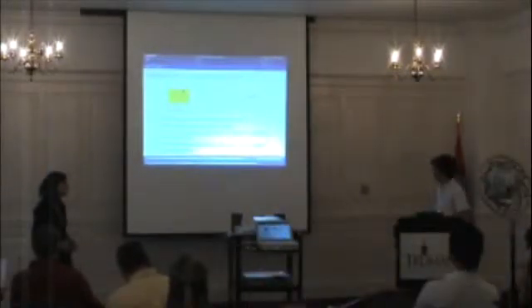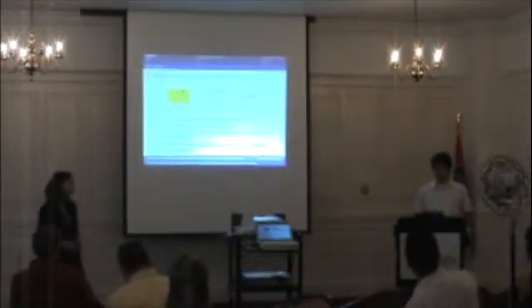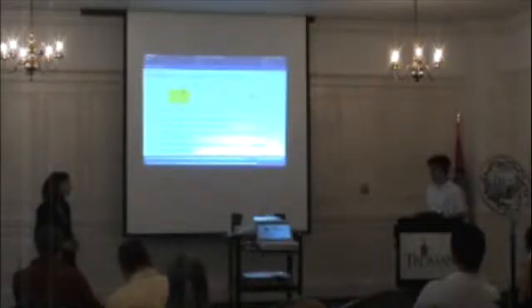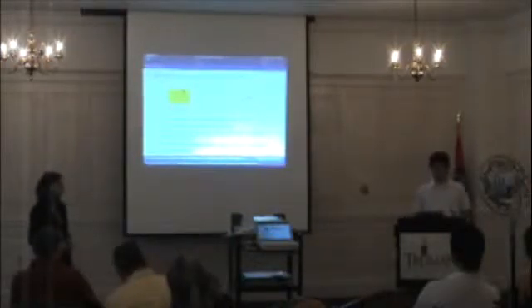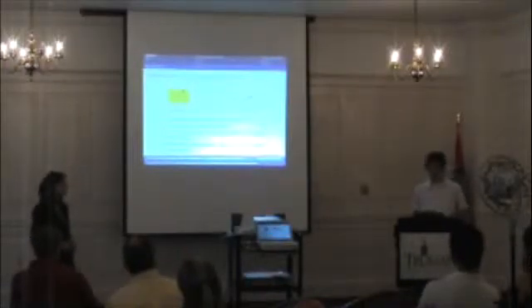C. elegans has a very rapid period of embryogenesis. Within 16 hours, we can go from a 1-cell fertilized egg to a hatched young nematode worm. And this is important because within our project, we're looking at modeling embryogenesis, and this quick embryological process allows us to efficiently gather data that we can use and segment and put into our model. If it was, say, a 4 or 5 day or even possibly a month embryogenesis, it would not be feasible really for us to gather data with the quality that we're looking at.